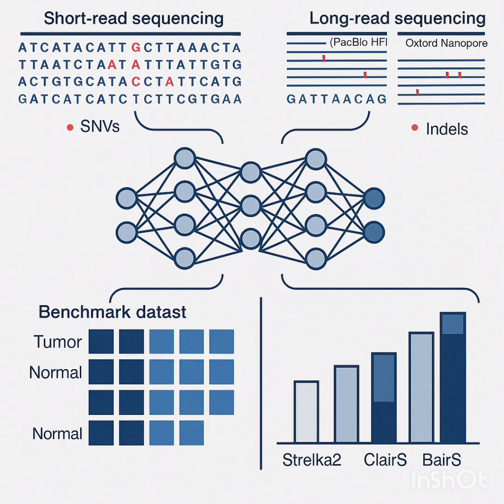What about really challenging samples? Like the old archive samples stored in formalin, FFPE. Ah, yes, formalin-fixed paraffin-embedded tissues. Standard practice for storing clinical samples for years, but the formalin really damages the DNA. It creates specific chemical damage patterns that can look exactly like mutations to a variant caller. Tricky. Very. But DeepSomatic was adapted for this too. They tested it on FFPE whole genome sequencing data, and it got an F1 score of 0.88 for SNVs. Significantly better than Strelka2 and ClairS on the same FFPE data. That's huge for unlocking all that historical data sitting in pathology labs. Absolutely, it opens up vast archives for research.